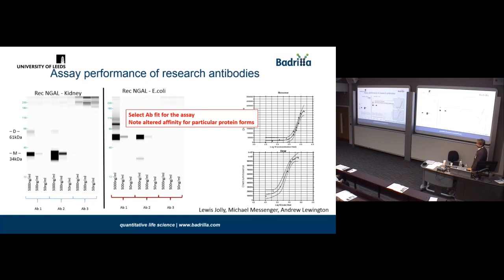And do you think it's really that low affinity, that you haven't reached saturation yet, maybe at 5 micrograms? Yeah, I don't know. I haven't gone higher and higher to know whether that's the true plateau. That's just a 4-point logistic fit.